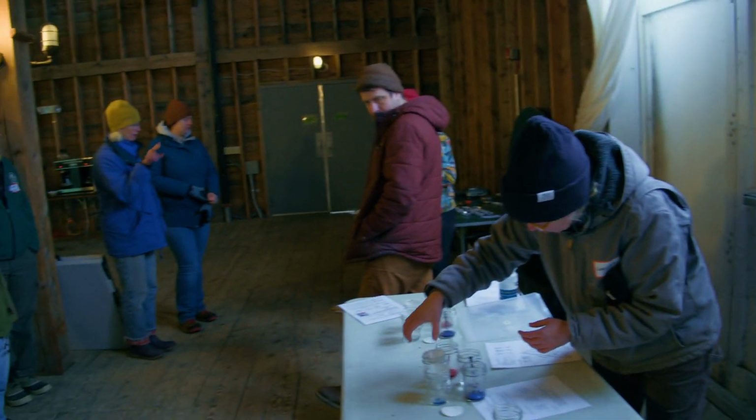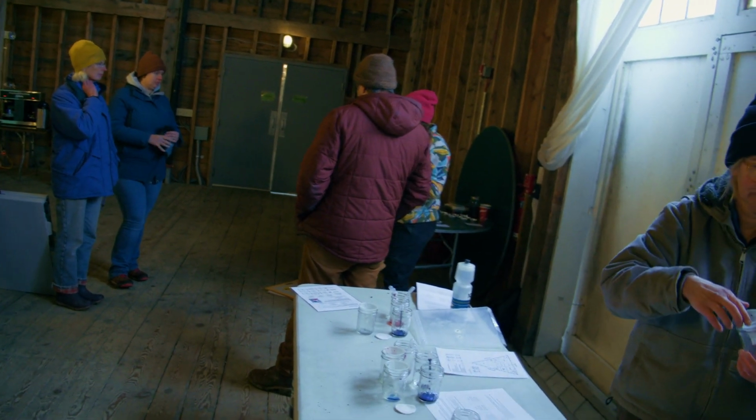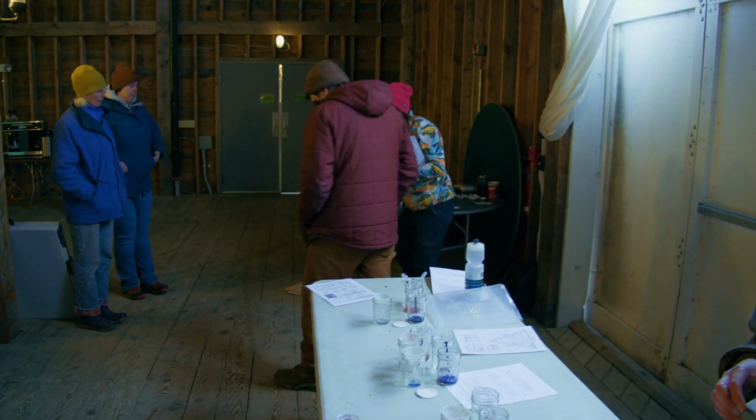So 2 tins over there and then back to get the same soil? Yeah. 2 tins, same soil. Sound good? Pairs. Go.